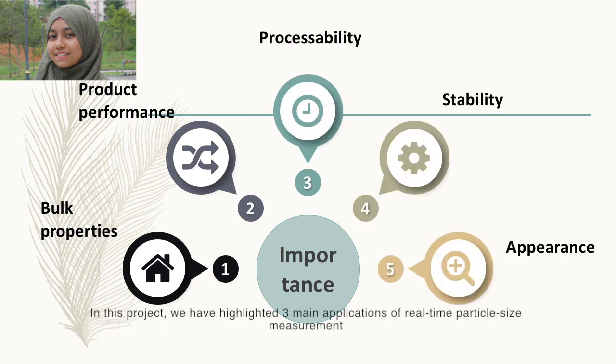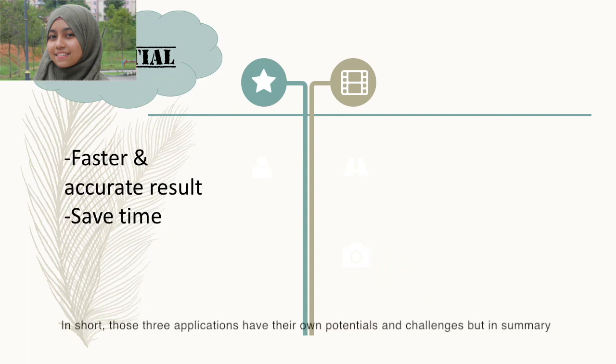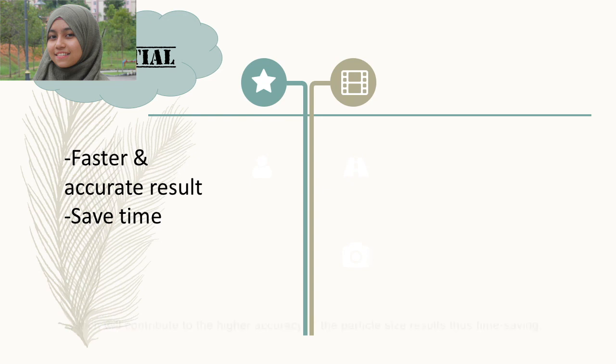In this project, we have highlighted three main applications of real-time particle size measurement in crystallization, semi-solid formulation, and granulation in terms of its potential and also the challenges. In short, those three applications have their own potentials and challenges, but in summary, the real-time particle measurement enables a faster and reliable process which will contribute to the higher accuracy of the particle size result, thus time saving.